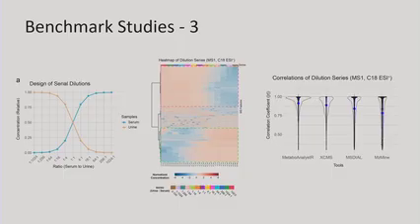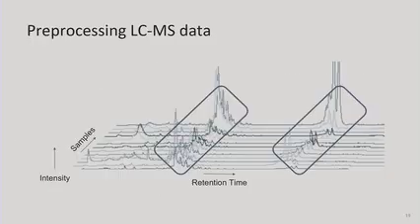MetaboAnalyst could find the highest correlation coefficient. So this is just a brief introduction of some benchmark studies. So I would like to summarize a little bit.